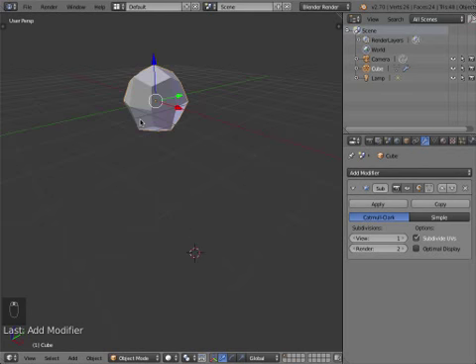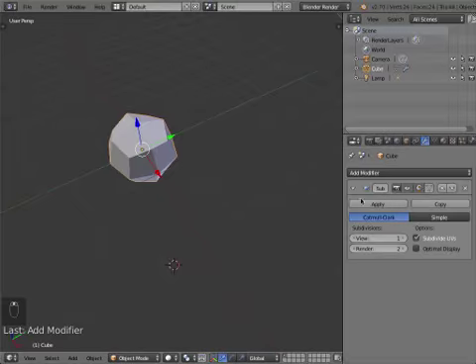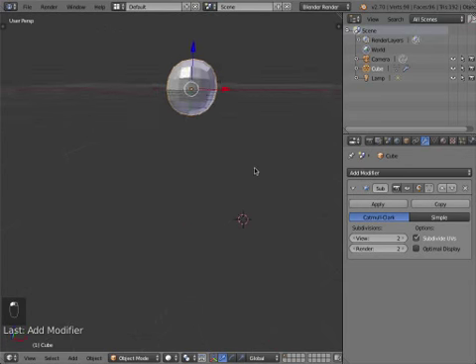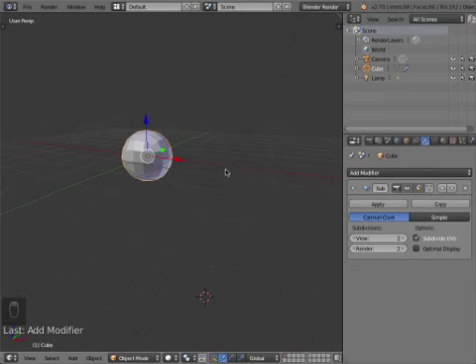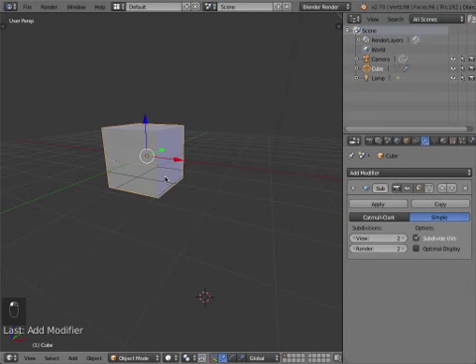So this is the first order subdivision surface of a cube. It just smoothes things out. Second order. So it just gives your object a smoother quality. If you use Catmull-Clark, that's a regional Bezier spline approximation, or the other one is just simple.